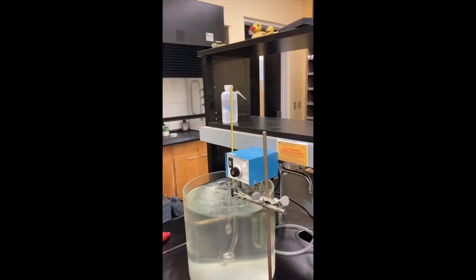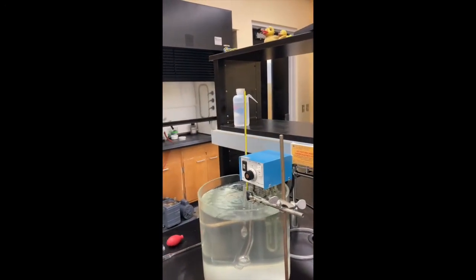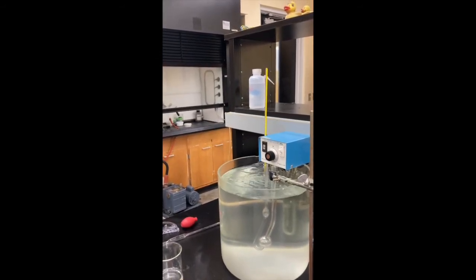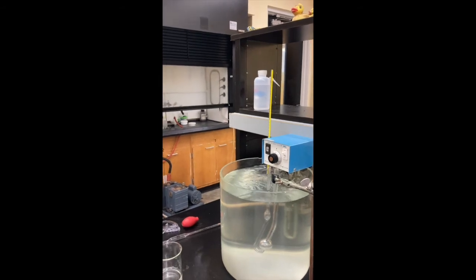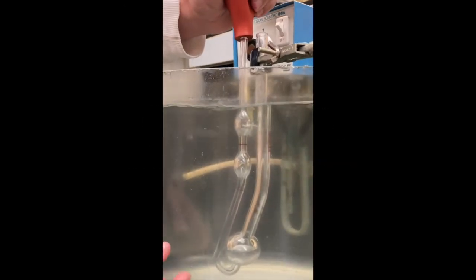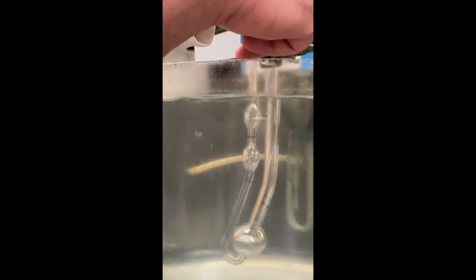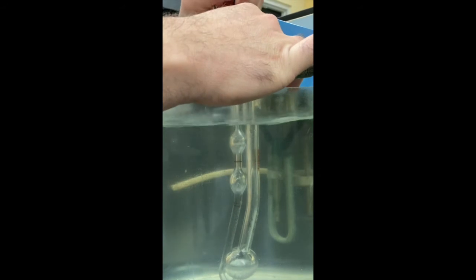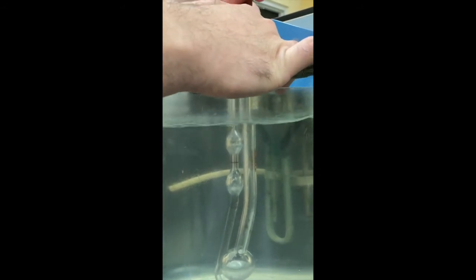So now we have 10 milliliters of water inside this viscosimeter, and we need to suction above the upper position. Now we are trying to suction water so that it flows above the mark.